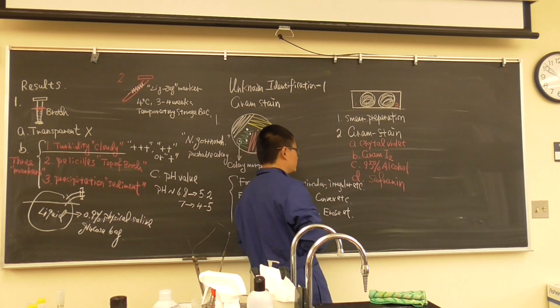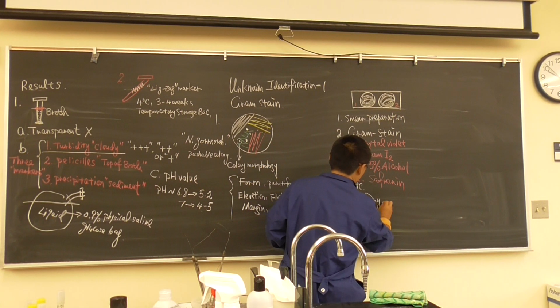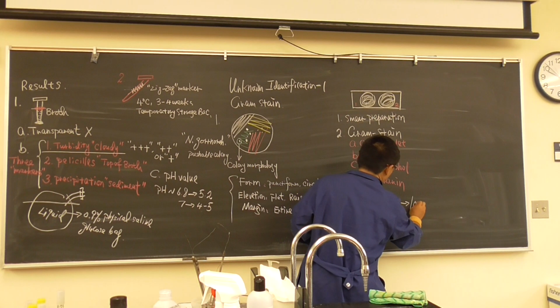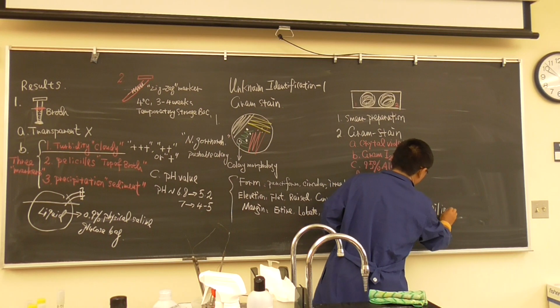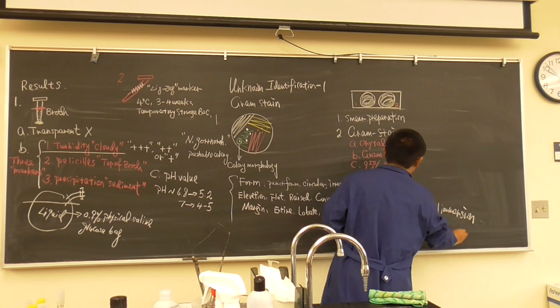Okay, then the steps will be to dry, and then use 10x to find the specimen, and switch to 100x with oil immersion. You will find 3 pieces of information about the bacterial results.